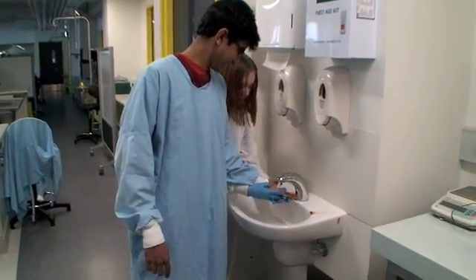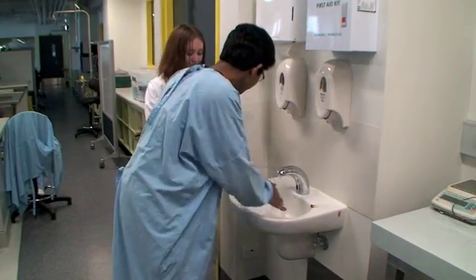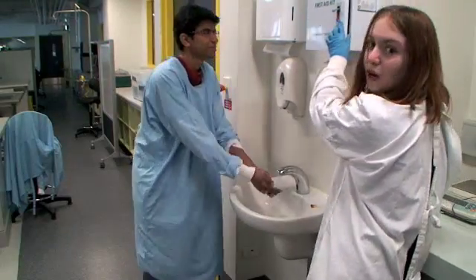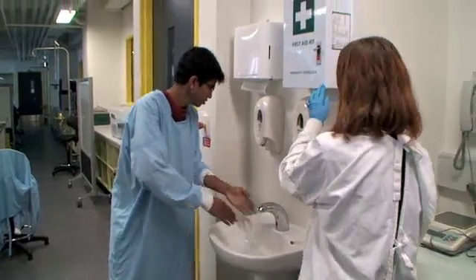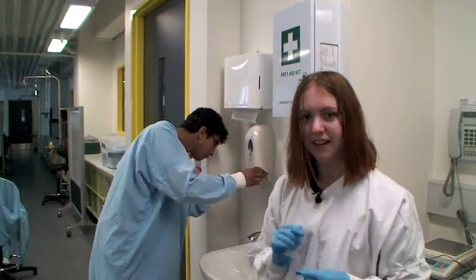Wash the wound, dry it, and then apply a clean bandage. At this point, you'll also need to make sure that you fill out an incident report.